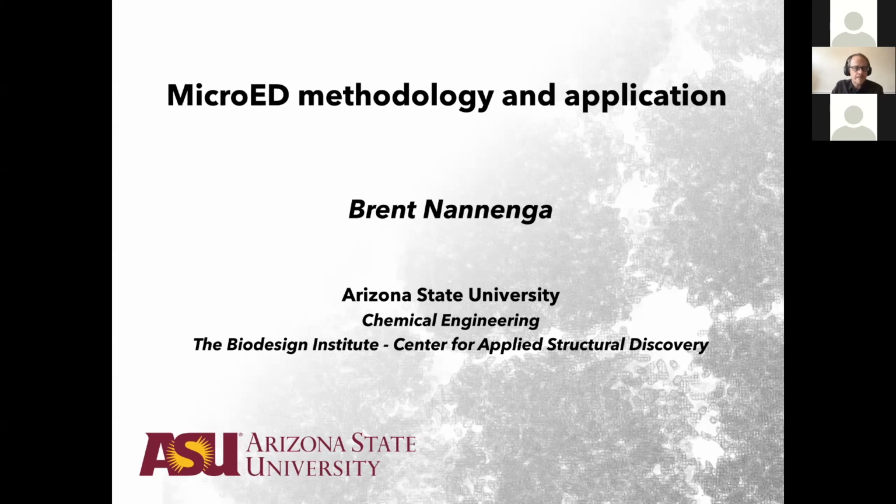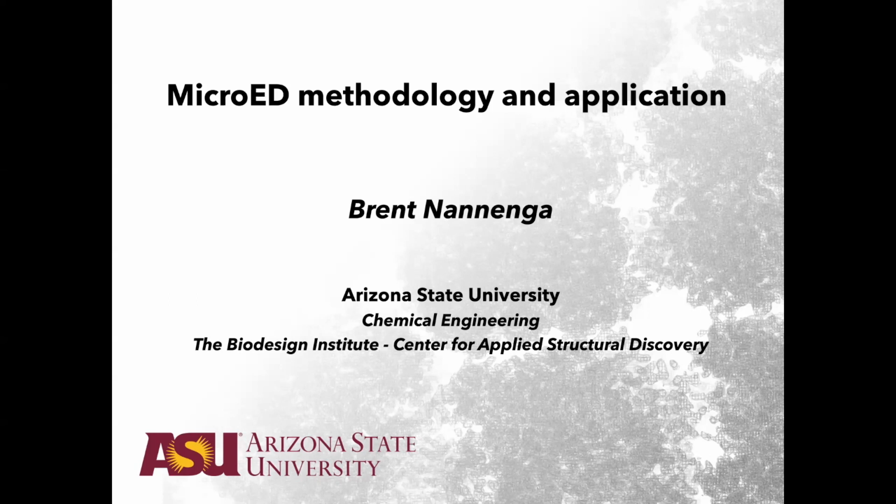All right. Great. Thank you. So today I'm going to talk about the technique of microcrystal electron diffraction, or MicroED. We're going to go over sort of the methodology, how the technique works, and then some quick examples of different samples that you can use this technique on that have come about recently.